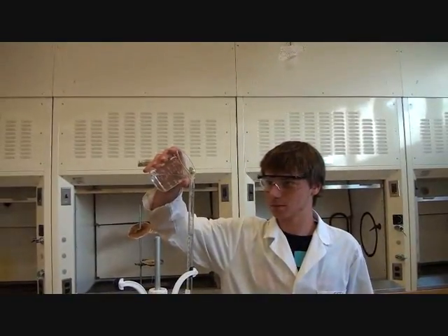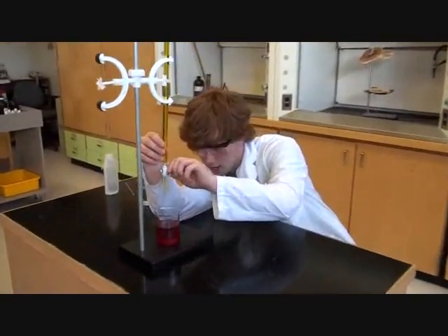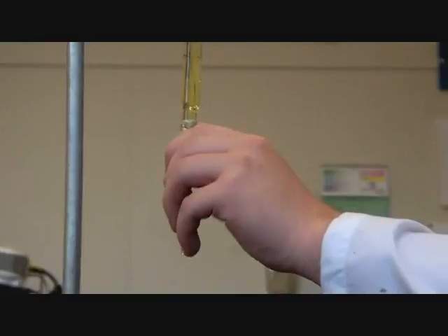To pour in the base, don't stand up on a stool. Lower the burette, don't make the errors of a fool. Turn the stopcock, go easy now. You gotta be careful, or else you'll milk the cow.